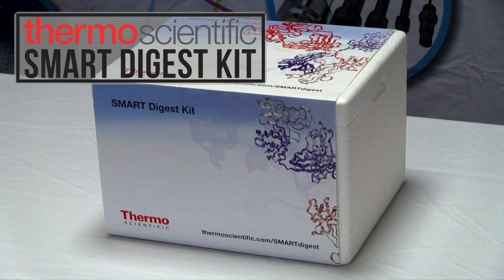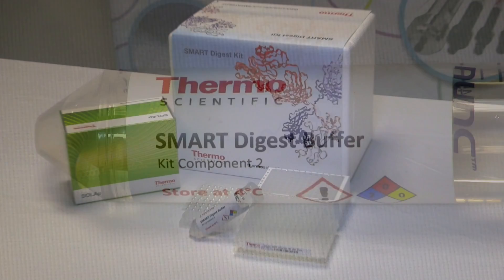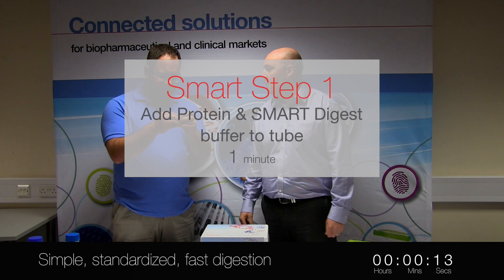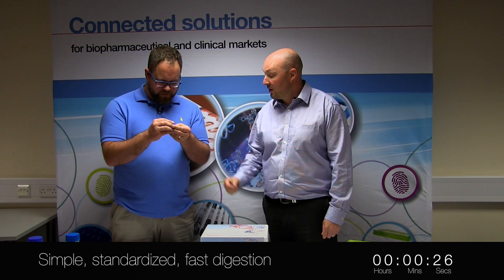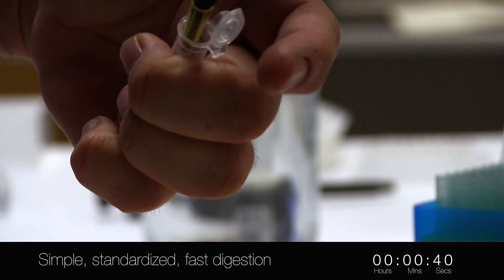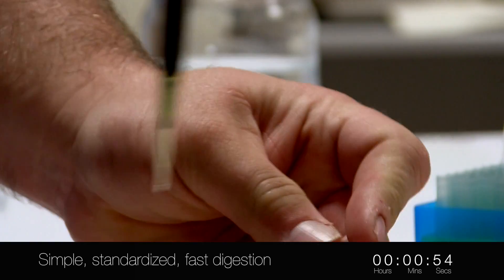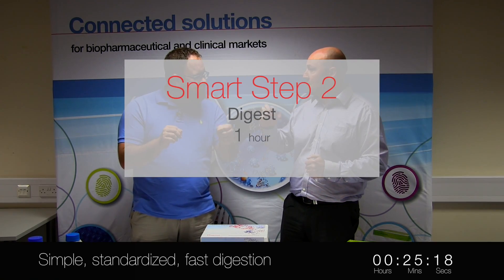Thermo Fisher Scientific Smart Digest Kits come with everything you need in one box — in 96 samples, you get your buffer and also a collection plate. I'm going to give you one of our little PCR tubes with the immobilized heat-stable trypsin resin in there. You're going to get 50 microlitres of your sample and 150 microlitres of the Smart Digest buffer. Put it into a heat shaker turned up to about 1400 RPM, 70 degrees C.